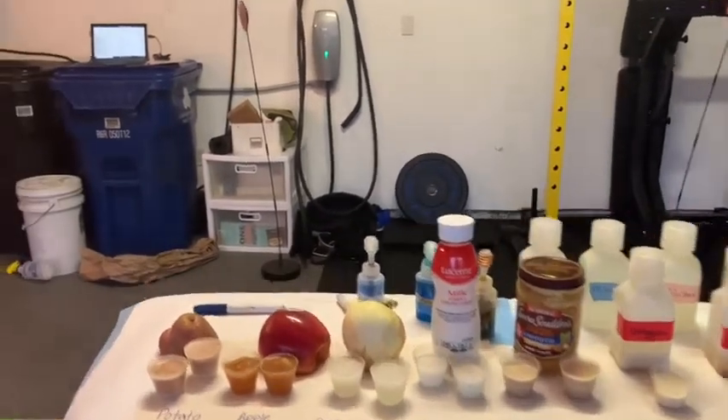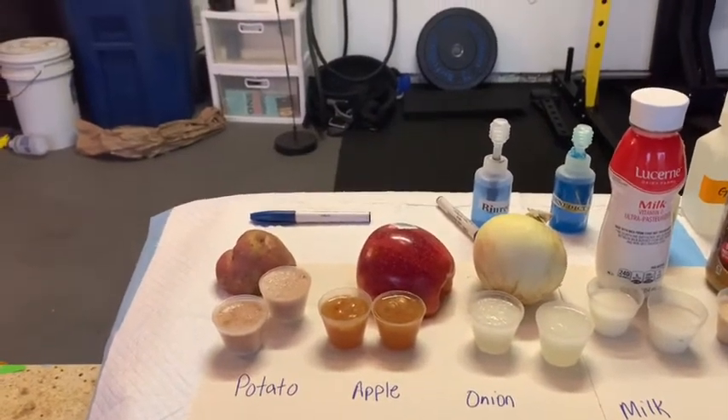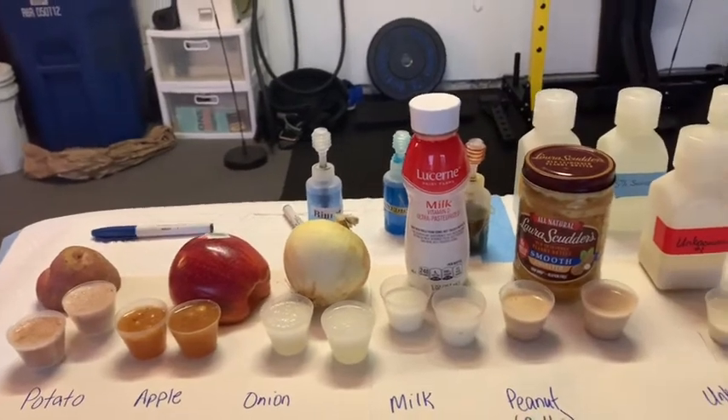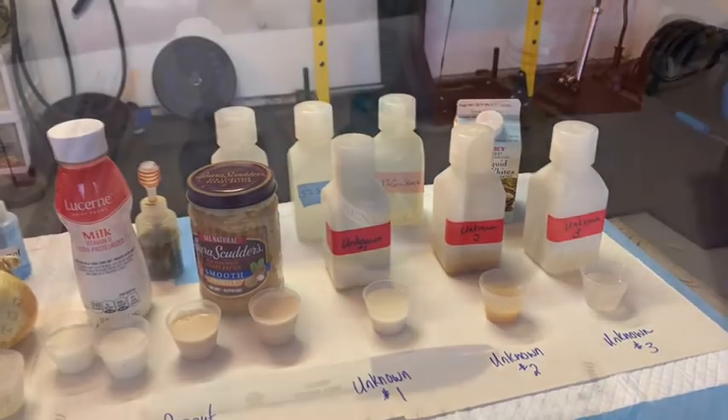Specifically, we are going to be taking a look at the macromolecular composition of potatoes, apples, onions, milk, peanut butter, and three unknowns that I bought at the grocery store.